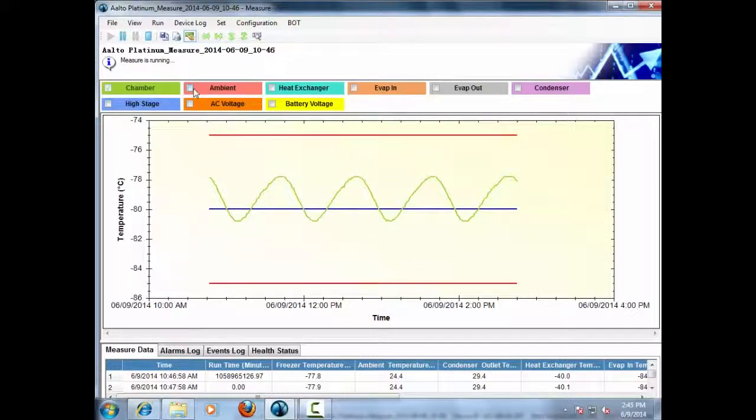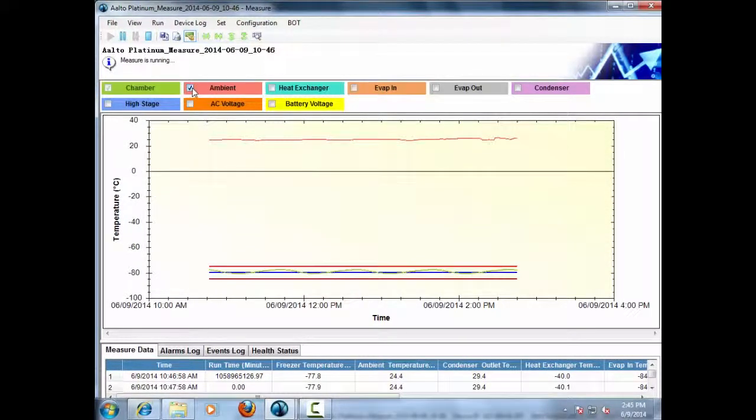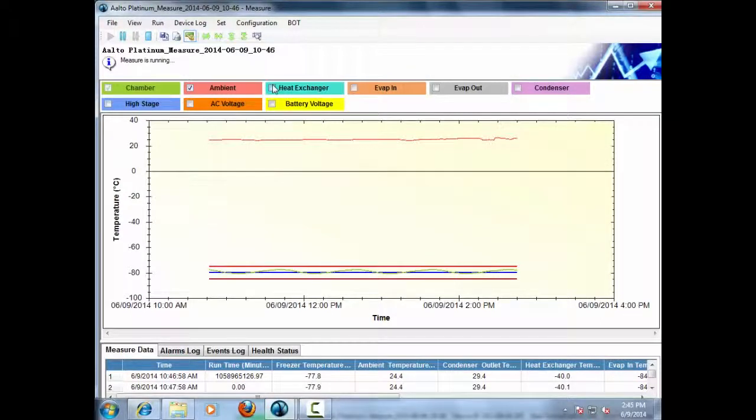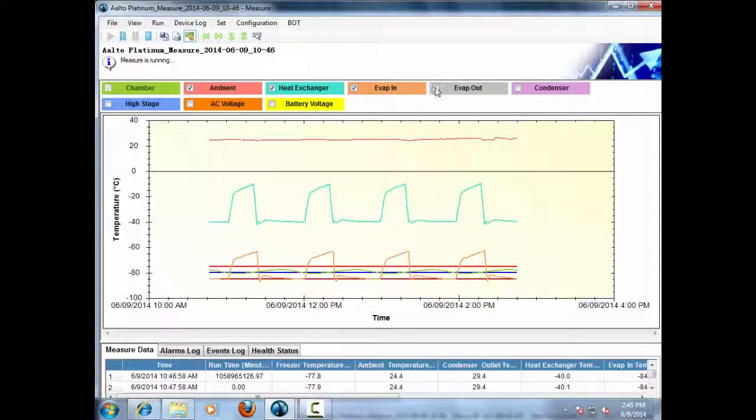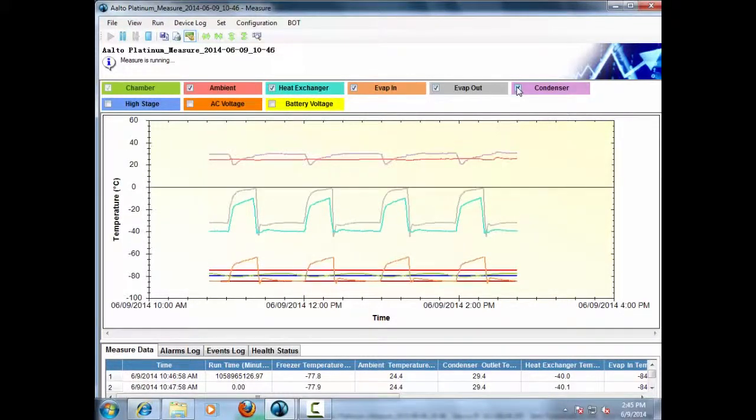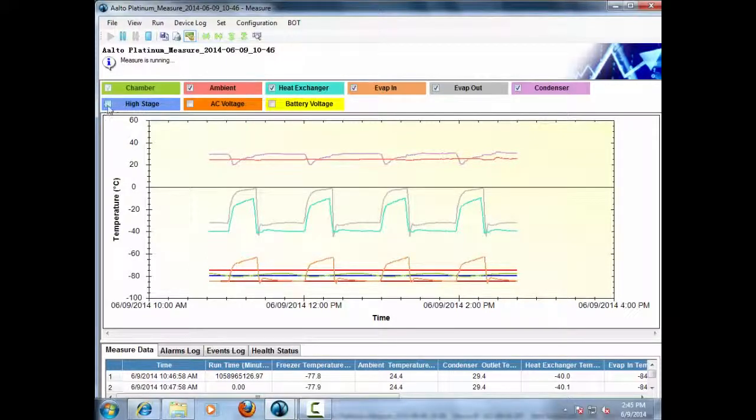Users can either view each of the sensor data individually or all sensor data in one graph except for the AC voltage and battery voltage which can be seen individually since their scale will be different than the others.